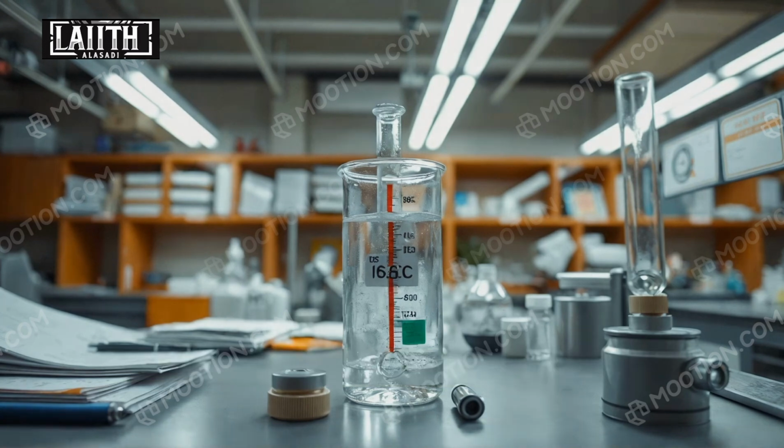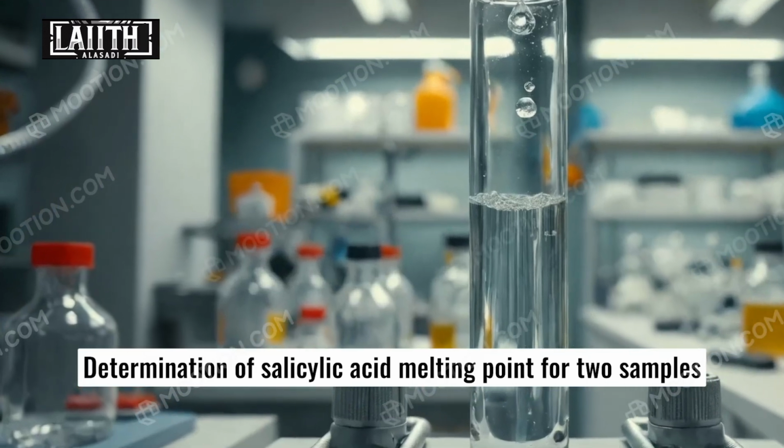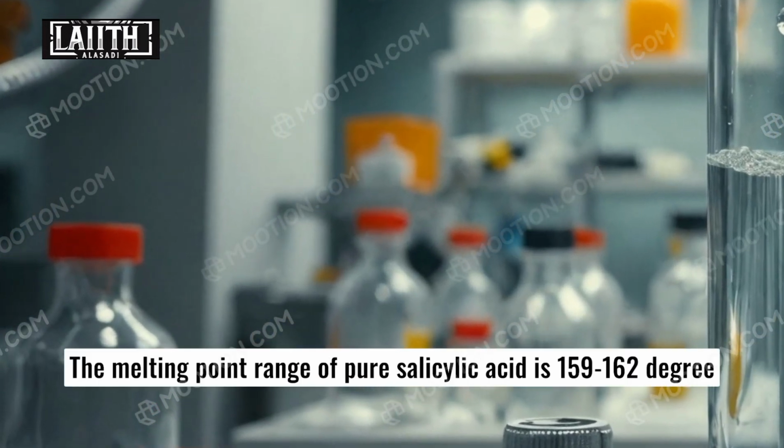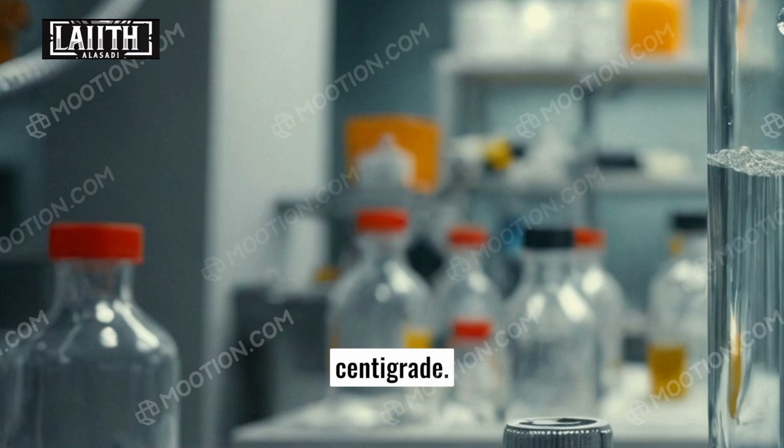Practical work. Determination of salicylic acid melting point for 2 samples, pure and impure. The melting point range of pure salicylic acid is 159 to 162 degrees centigrade.